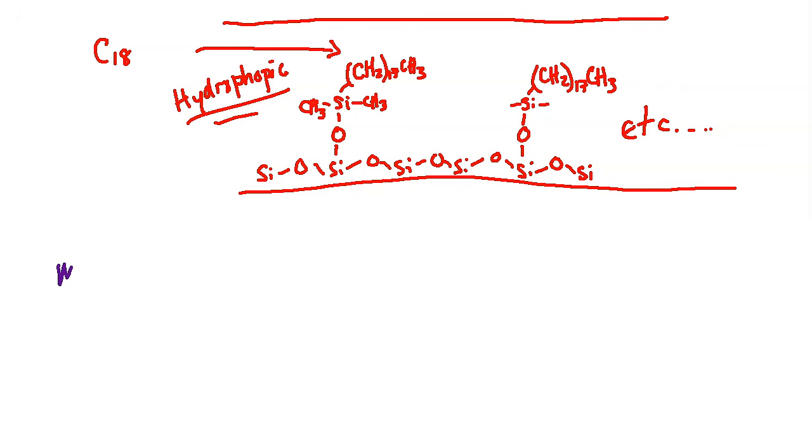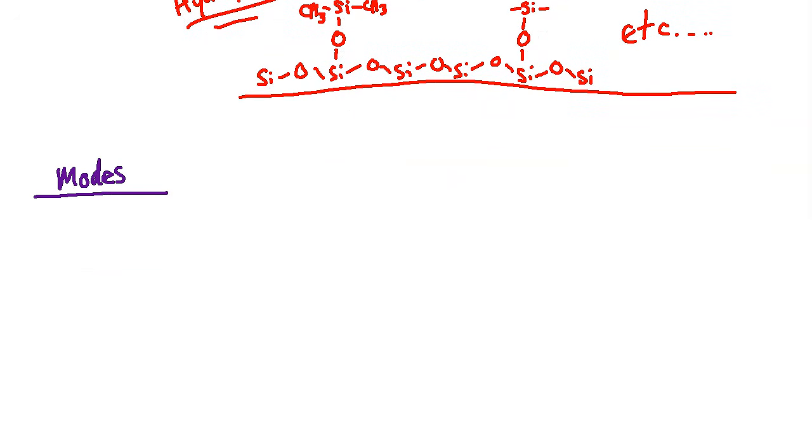Because if you remember, I mentioned that there are several modes, and each one of them could have their own lecture in terms of what's involved. So the first mode that we would talk about is just normal phase.